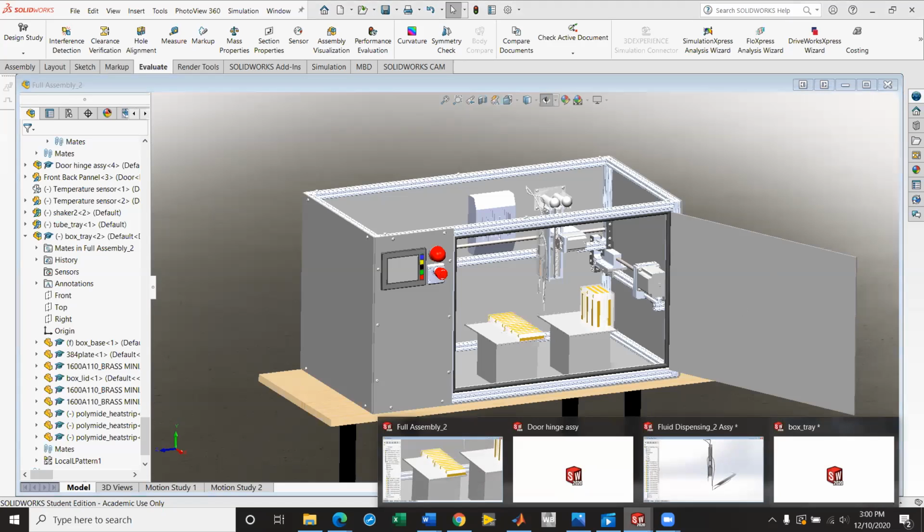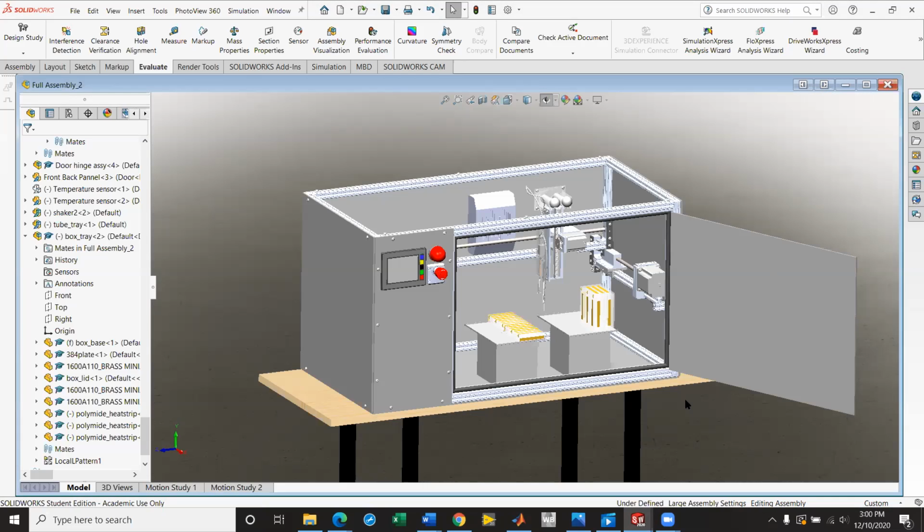Right. So is that LED array for a specific size well plate? What we were figuring is that, based on the size of the well plate, the controller would turn on a certain amount of LEDs per experiment, based on the size of the well plate, to be able to actually record the optical density.